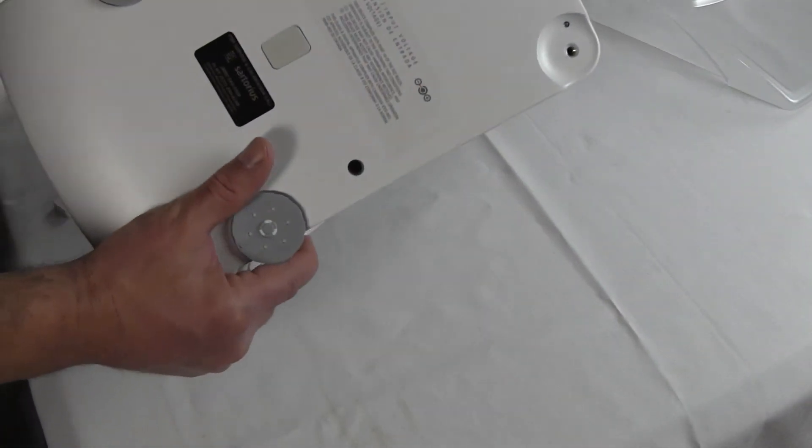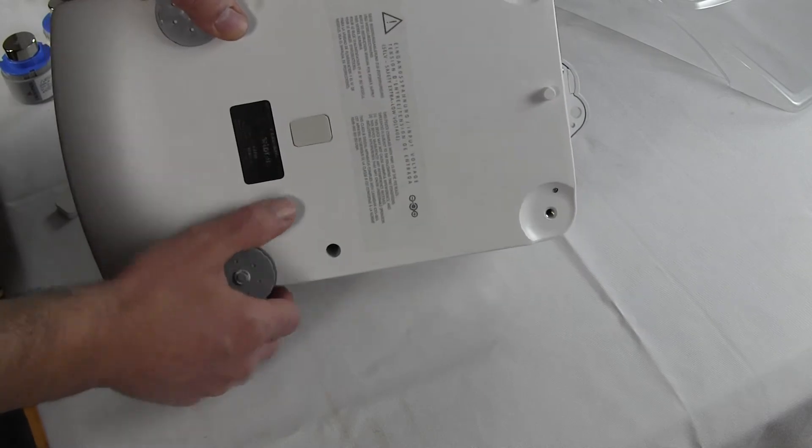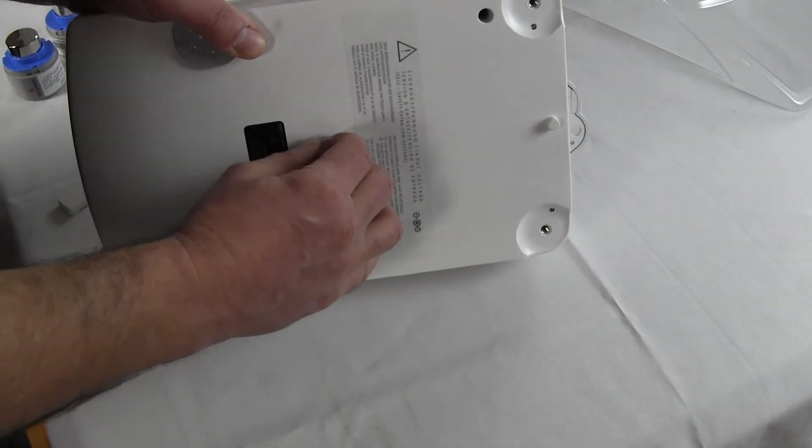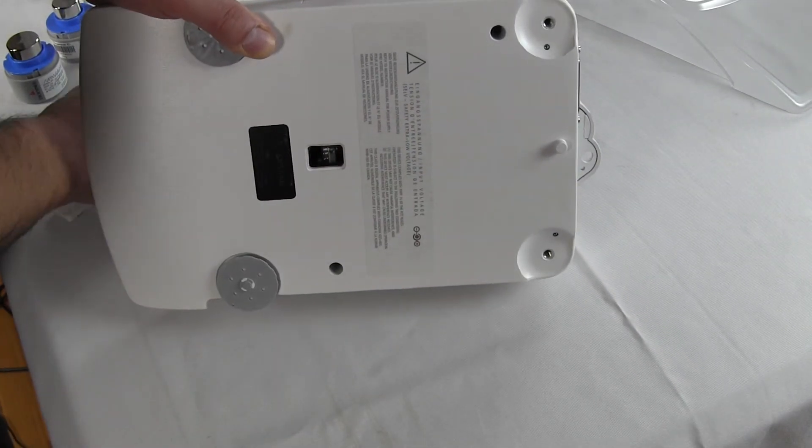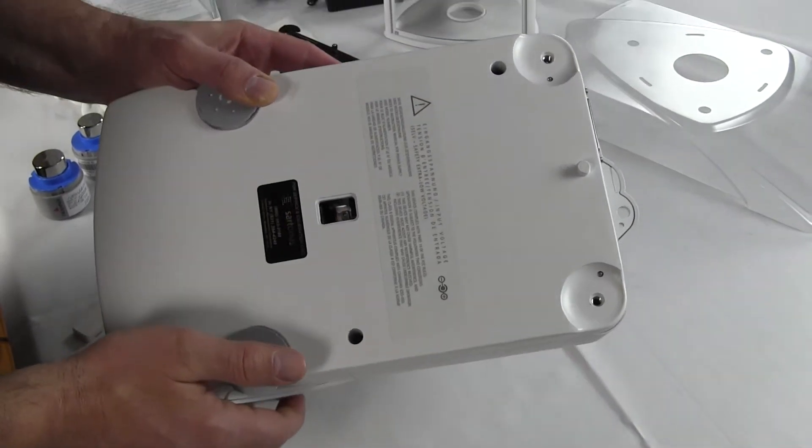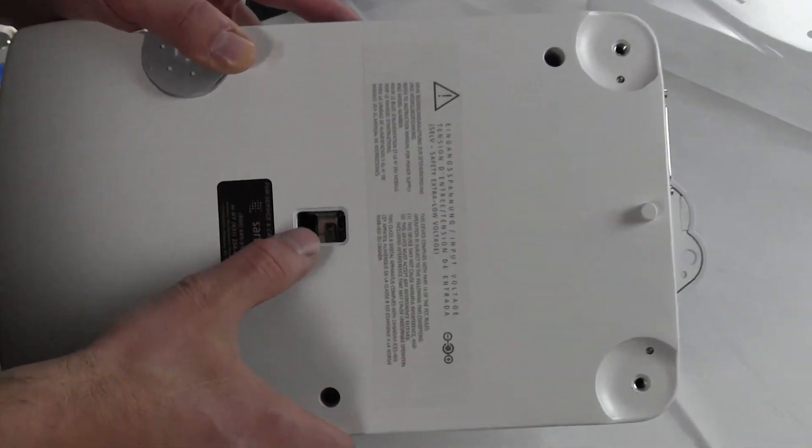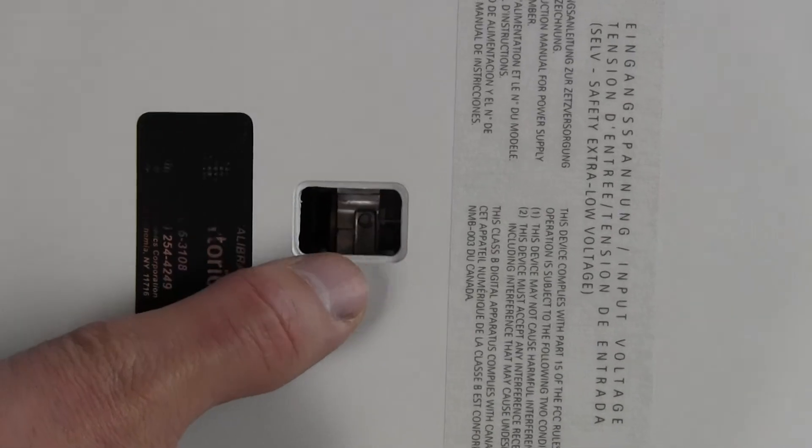On the bottom of the balance that I was speaking about before is this little port here. This port is for if you wanted to weigh magnetic material. There's an underhook right here. And one would hang a wire and you could actually weigh hot material or magnetic material.